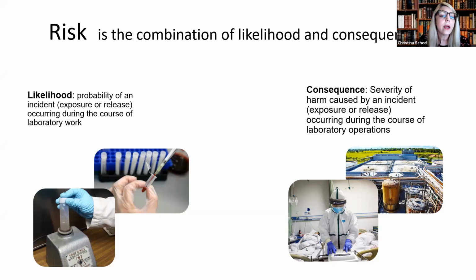So on the left, we have procedures that are being done that could cause aerosolization, pipetting, vortexing. And so that is something that would contribute to likelihood. Consequence is shown on the right. If there was an exposure, it could result in hospitalization, or if it was a pathogen that affects the environment, it could be much larger than that.